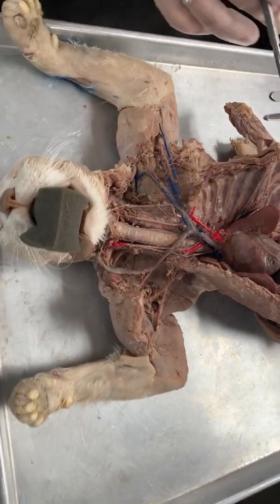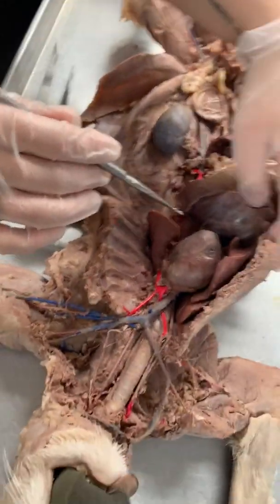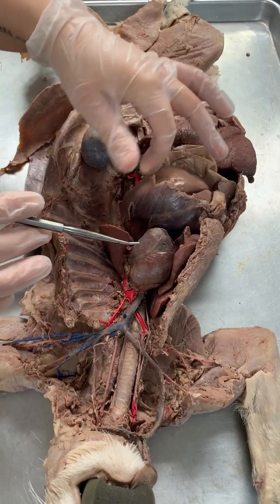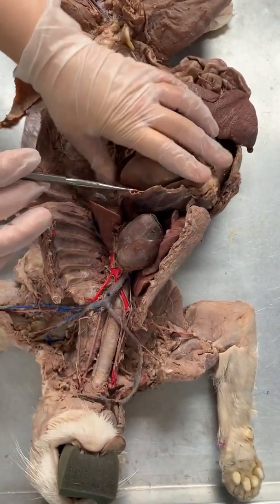Let's go to below. Ooh, you opened a kidney, fun. Okay, so once again, to orient you, here is the diaphragm. All right, fabulous, beautiful muscle. Ooh, look at that ligament, love it.